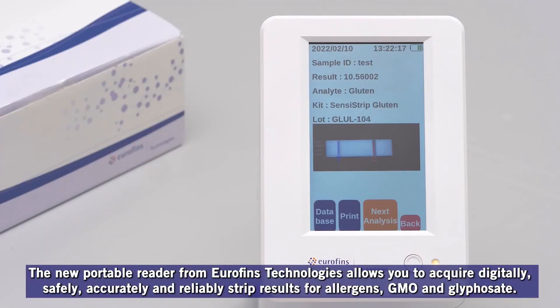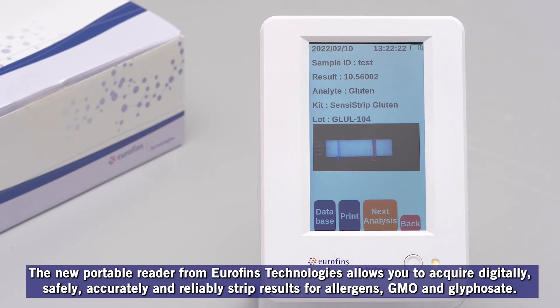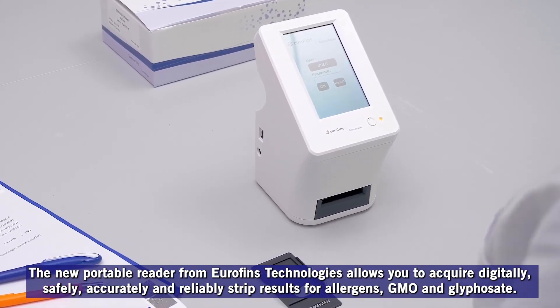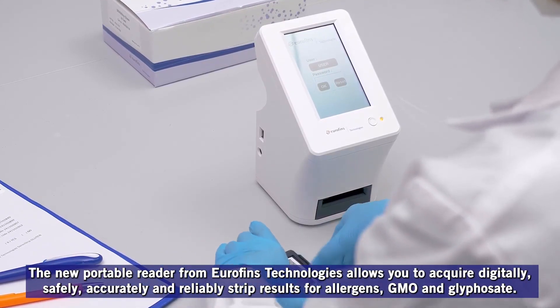The new portable reader from Eurofins Technologies allows you to acquire digitally, safely, accurately, and reliably strip results for allergens, GMO, and glyphosate. For information, contact us.